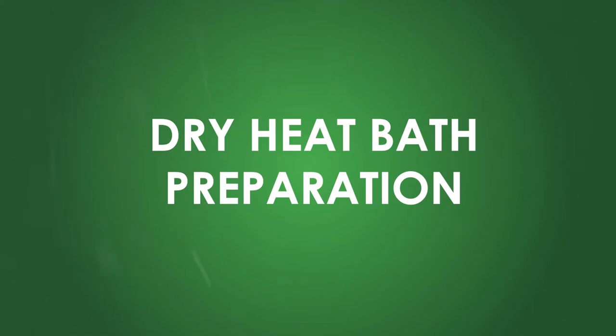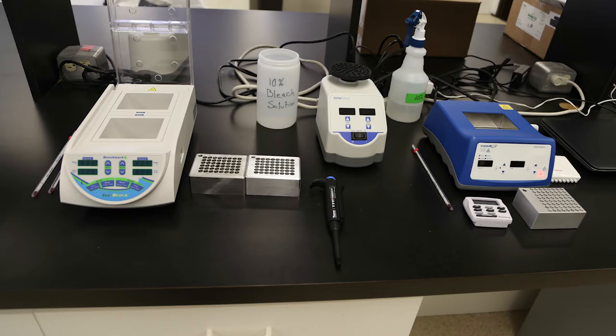Dry heat bath preparation. While the reagents are adjusting to room temperature, you can set up your dry heat bath units. Follow the manufacturer's instructions for calibrating and oiling the dry heat bath units your lab uses. This video demonstrates the setup of a benchmark dual dry heat bath and a single VWR dry heat bath.